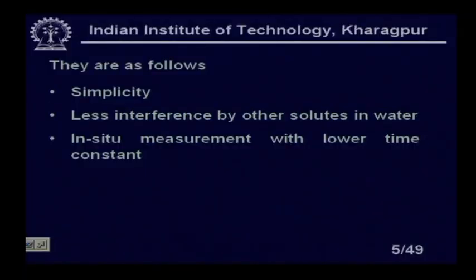You know, in situ measurement is basically a new term in instrumentation, which basically means on-site measurement. In the bioreactors, you will find that there are various parameters which we usually cannot measure, but when you write the state equations, you will find that those parameters have to be incorporated. One of those is the dissolved oxygen concentration, then we have the concentration of the product, the concentration of the substrate, all those things are unmeasurable. You cannot measure those quantities online, so you have to take a sample out, and a few in situ sensors have been reported, but they are not of much use, right.